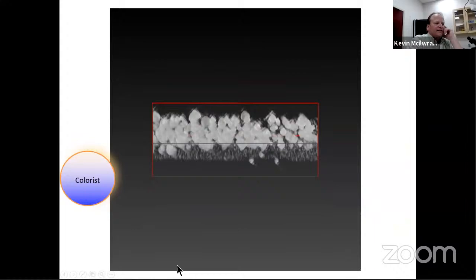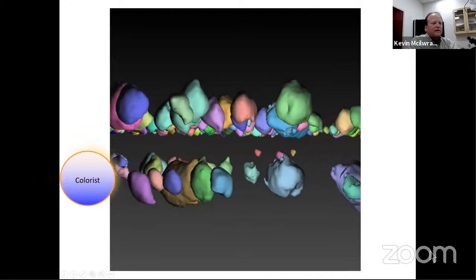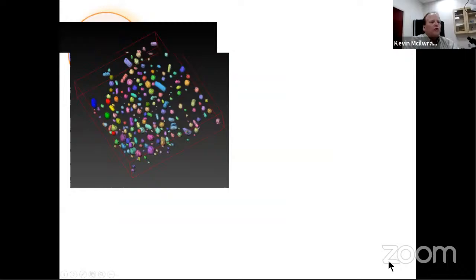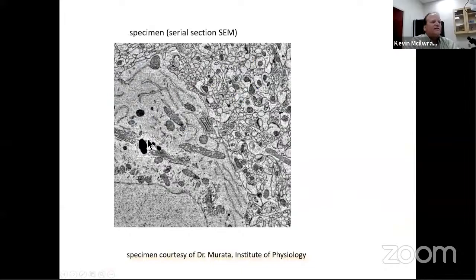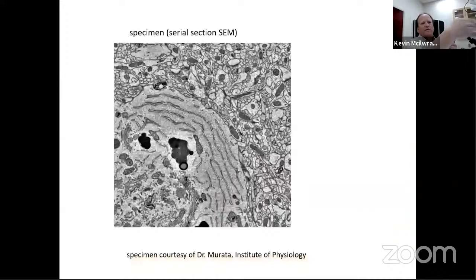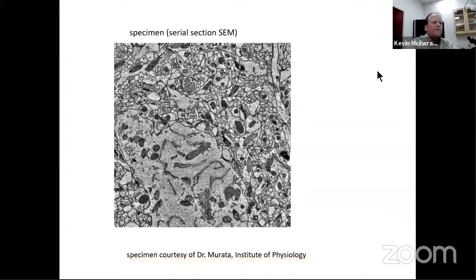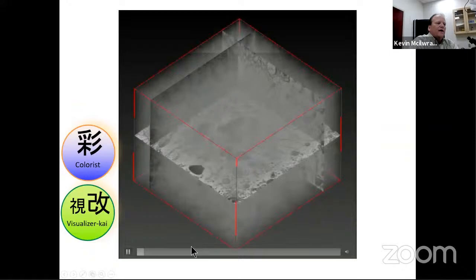So then we come in, we can view things, we can color things by size in the volume because we know kind of what we're looking at and get feedback and output. So then we can output useful information of counts and particle size and things. And then here's also that array tomography through an SEM, where we can actually just slice and view. In an FIB, we can actually cut through a sample and image. So certain scanning microscopes actually have a microtome built onto the stage, and it'll cut and image. And just another example of how we actually go through these data points.